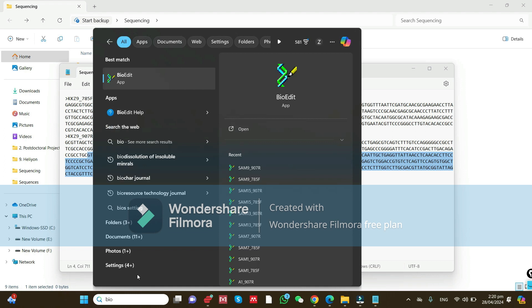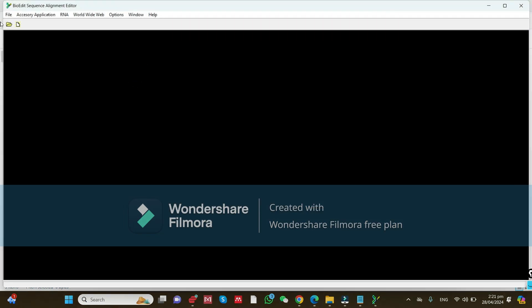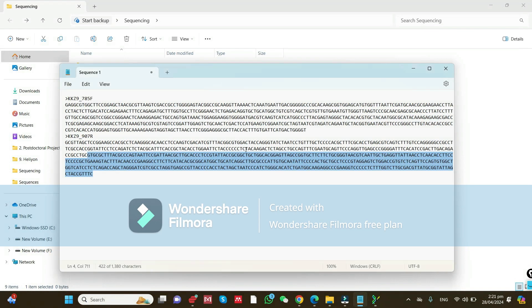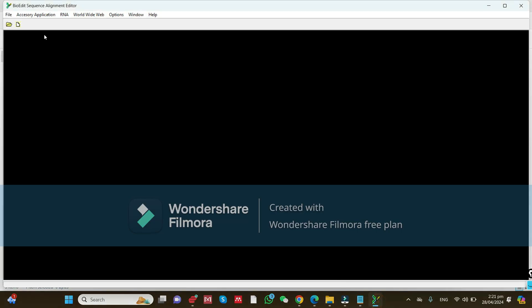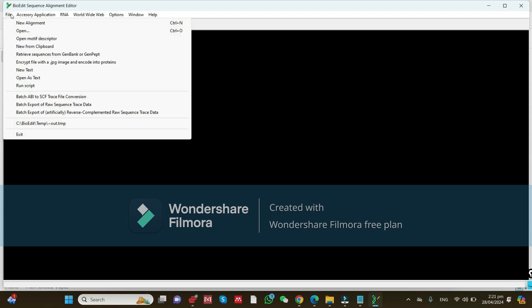After installation, type 'BioEdit' in the start menu and open it. Then take your trimmed forward and reverse sequences and copy them. Go to the BioEdit software, click on 'File', then go to 'New from Clipboard' — what you have copied is saved in the clipboard.